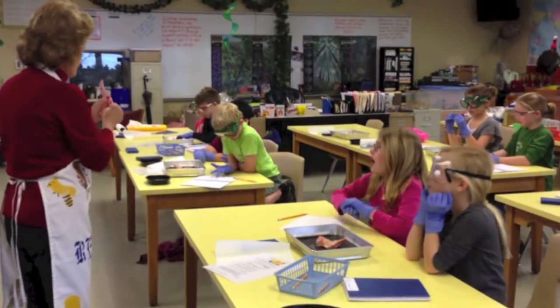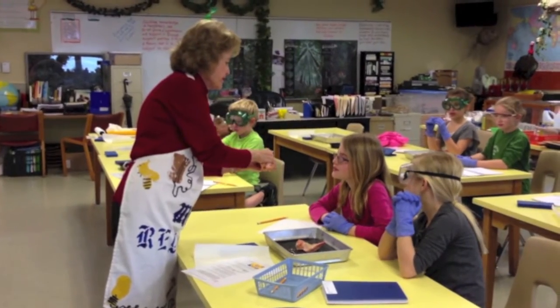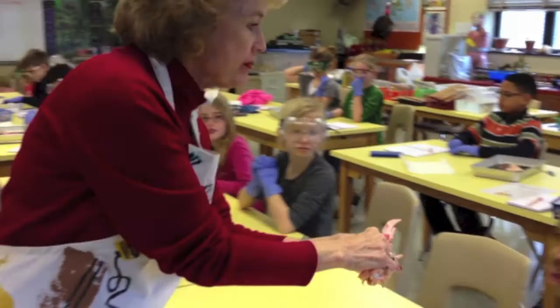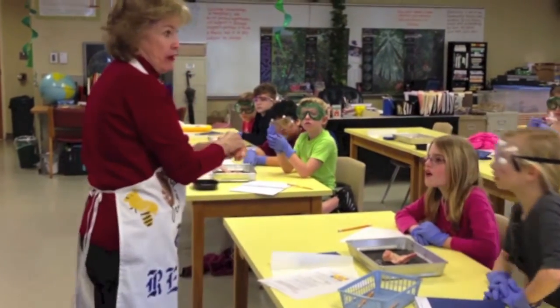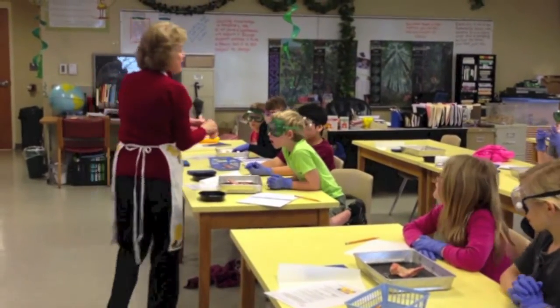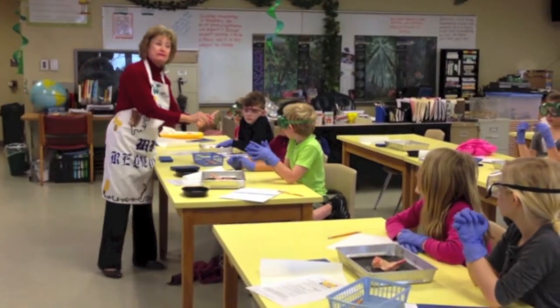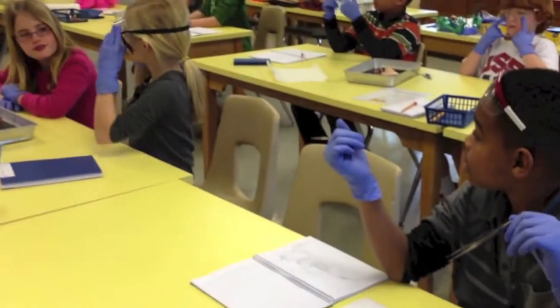I'm going to clip one, and you can see what color's in there. Sort of pinkish — sort of red. This is bone marrow, guys. And this chicken, before it met its end, had a living bone that was making red blood cells in there. And that's what happens in our bones too, guys.